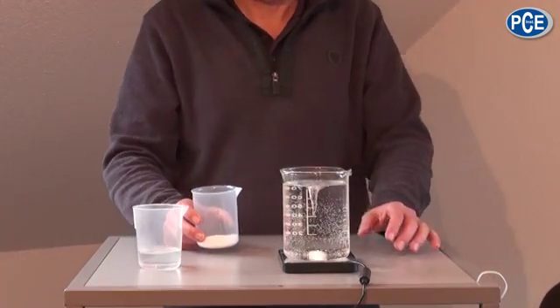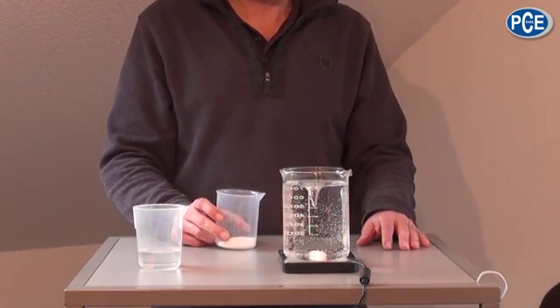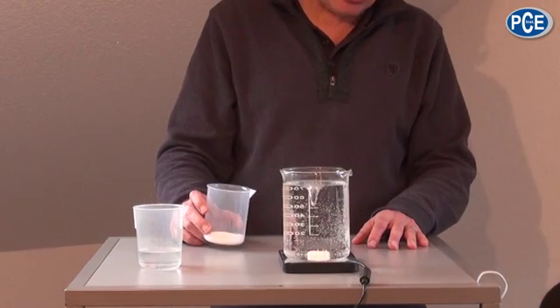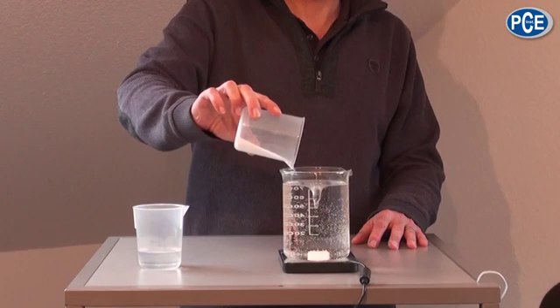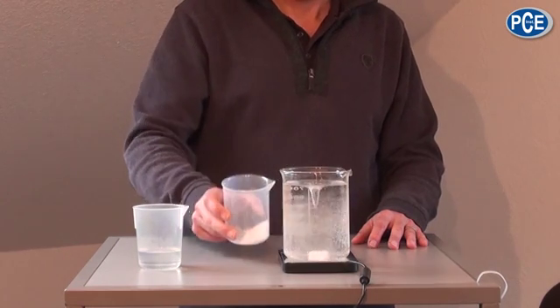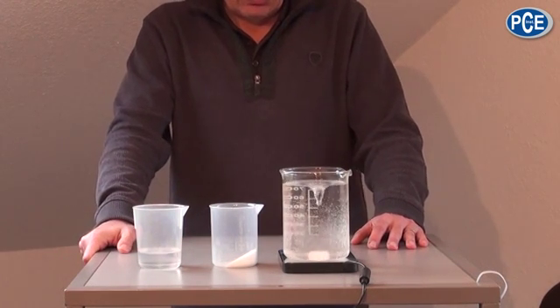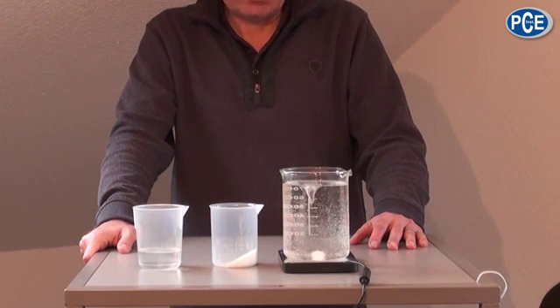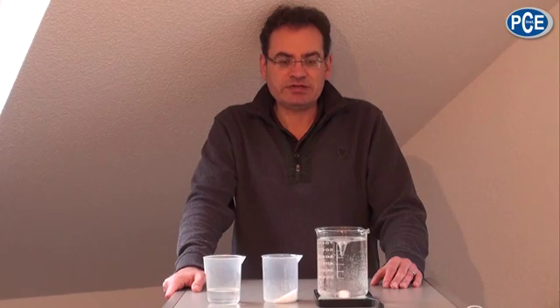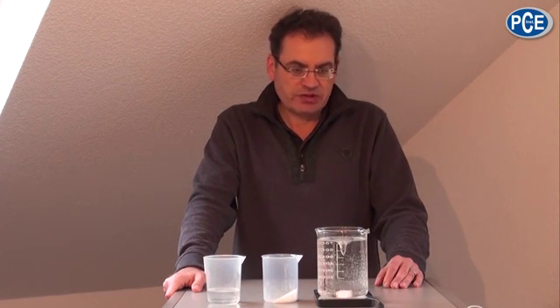You can demonstrate this very well. We have here mains water, which I've put into a magnet stirrer. This mains water is colourless and clear. And I can here put a white product, which is common salt, into it. Wait a few moments. And we can see that the salt has very quickly dissolved. That means that the water has mineralized itself with the salt. But I can't see any difference. The water is still colorless and clear.